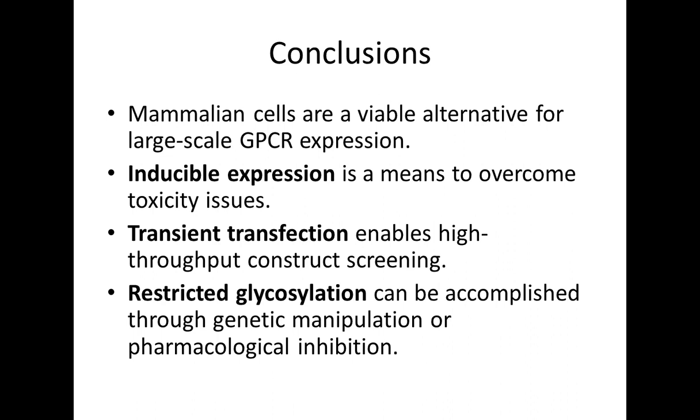The problem with mutagenesis is that it always leaves a question mark in your mind. Why exactly did this mutation increase the receptor expression? Lots of times it's because it's actually having an adverse impact on the ability of your protein to signal. So it's less toxic because there was less constitutive activity. And so when you start doing structural work, biochemical characterization, pharmacological characterization, there are always some concerns that it's not really as native-like as it could be.